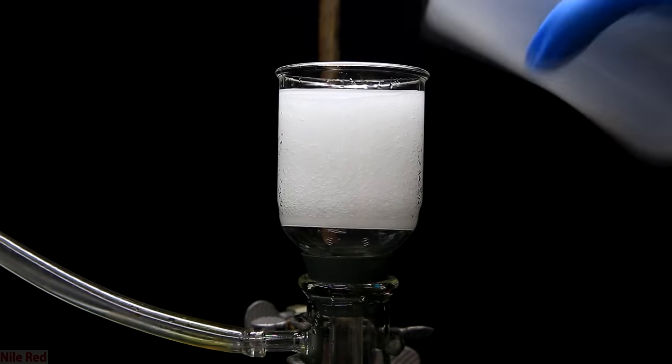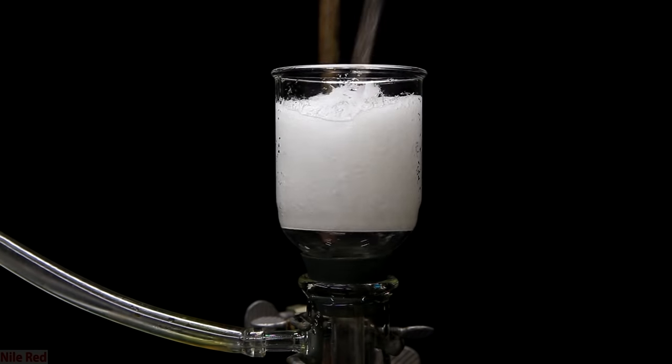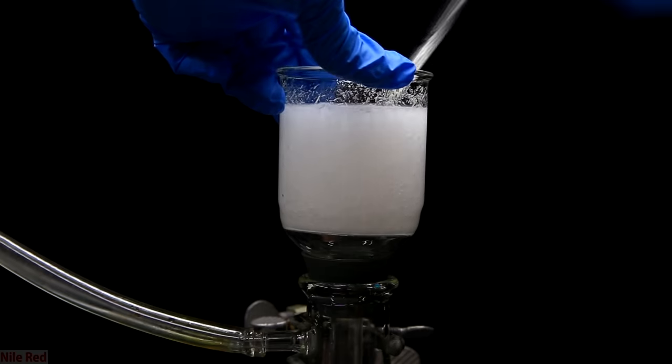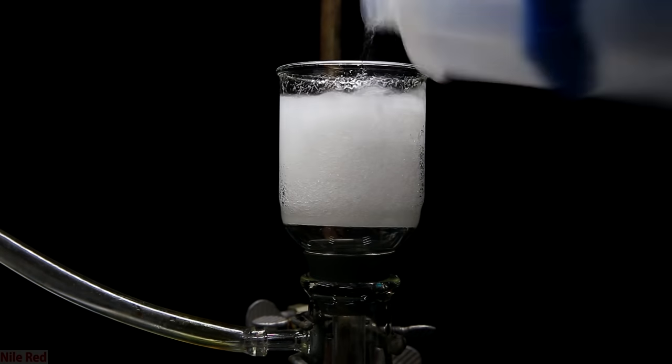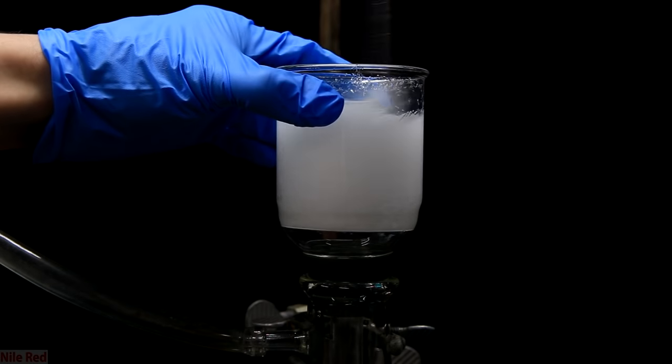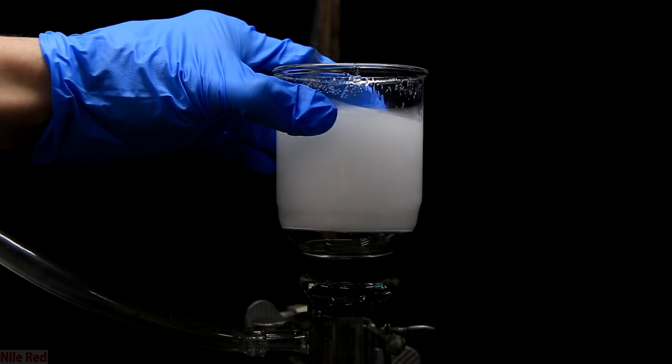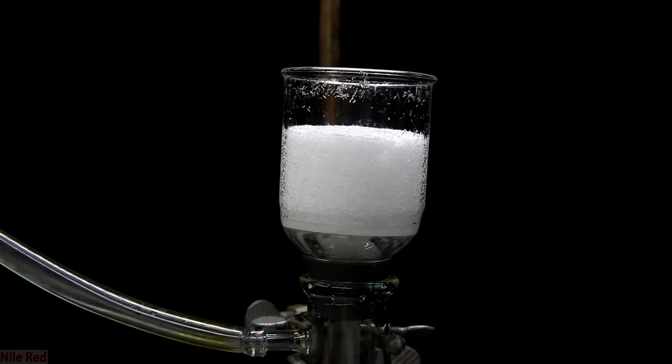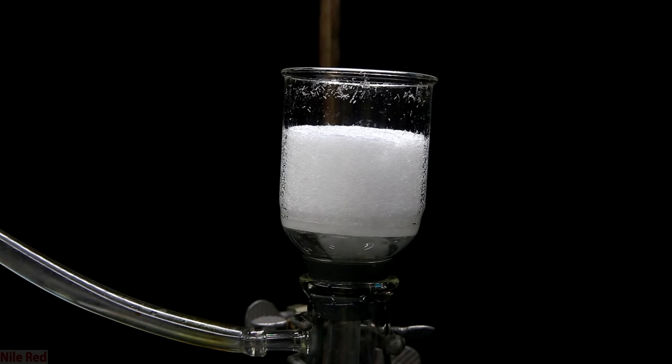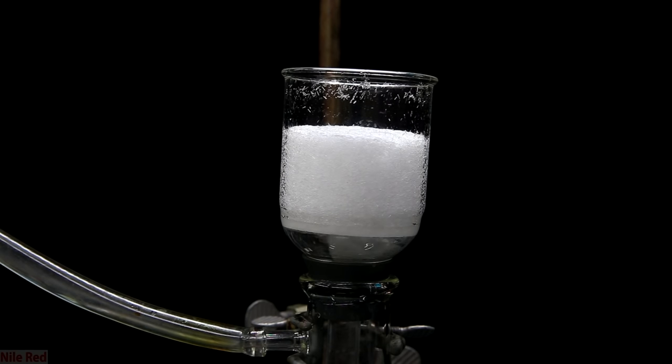Before taking it out though, we have to wash it with a little bit of ice cold ethanol. It's important to wash it a few times to get rid of the recrystallization solvent which contains impurities. Each time after the ethanol is added, using a metal spatula, it's thoroughly mixed to make sure that all of the crystals are washed. I decided to wash it a total of two times and after this, I pulled a vacuum on it to try to get out as much ethanol as possible.